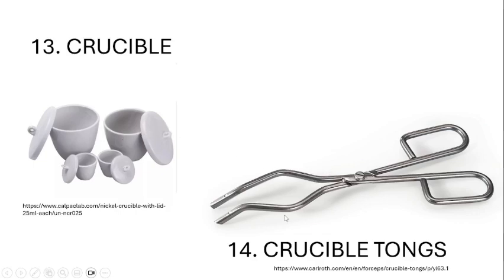Then we have your crucible tongs. So your crucible tongs are a tool with jaws that will be used to handle hot crucibles and other hot lab glassware, especially in heating. So when you start experiments with heating, you use these to hold your evaporating dish, your beakers, so as long as it could fit the jaws of the crucible tongs.